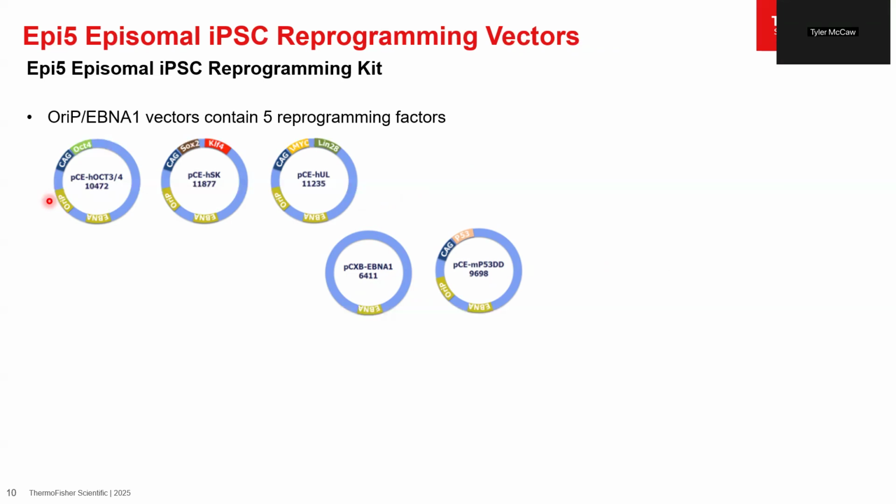Hey, thanks, Omar. Could I actually follow up on that? Yes, please. This is Tyler. Yeah, go ahead, Tyler. We've been doing Sendai-based reprogramming of T cells. So I guess the question is how would Sendai differ, or how would the RNA differ from the Sendai method? As you said, the T cells or PBMCs aren't adherent. They do, I guess, what people sometimes describe as loosely adhere to the bottom. So if there's minimal disruption or minimal manipulation, they kind of stay on the bottom. True. So definitely harder to work with, but we have been able to make it happen with Sendai at least.